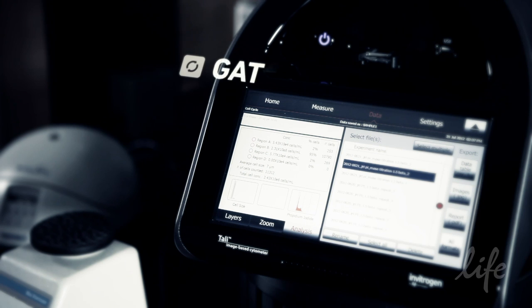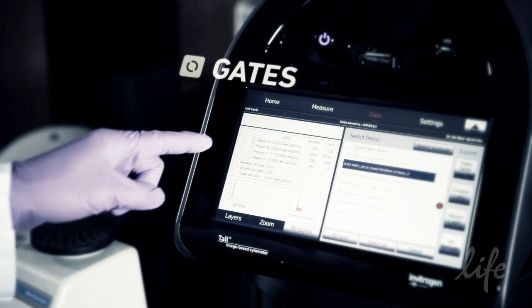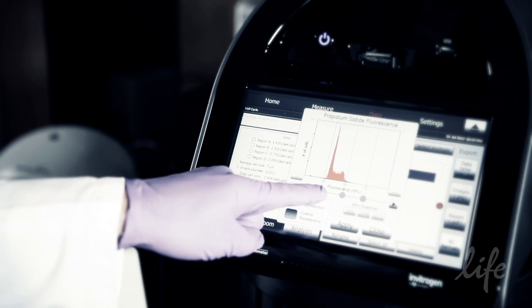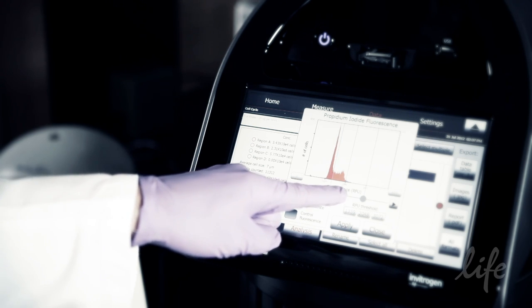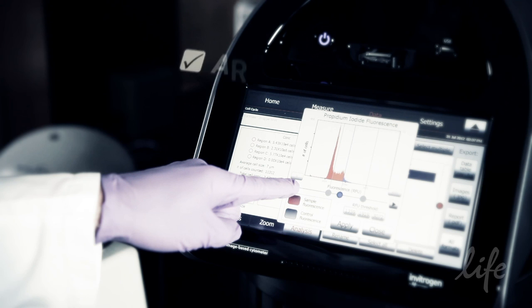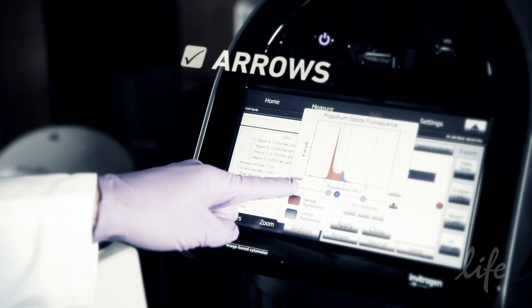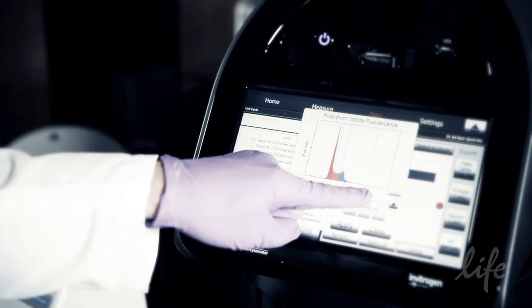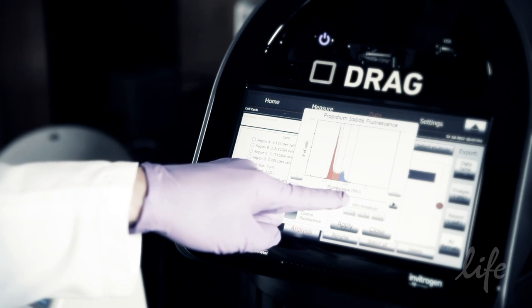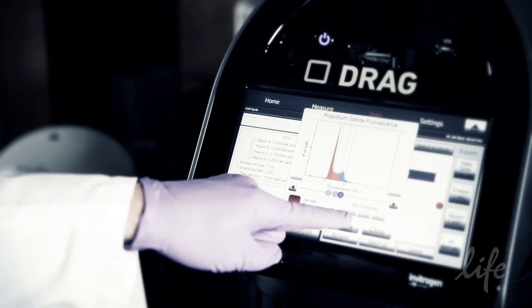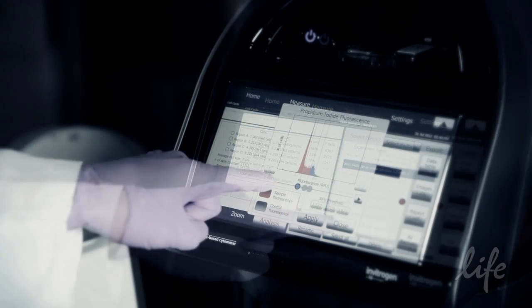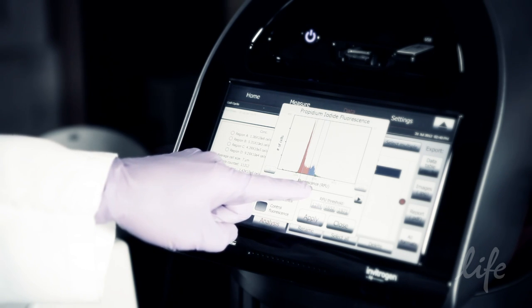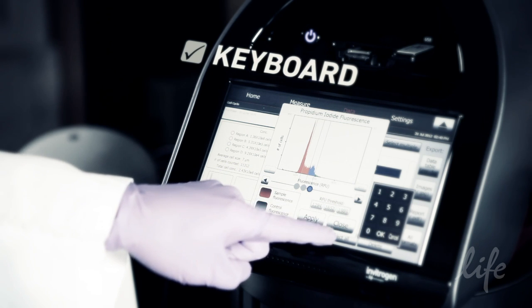The threshold gates for each cell cycle phase can be set in three ways. First, tap to select one of the three threshold bars (the grey vertical bars on the histogram); the selected bar will turn from grey to blue, then tap the arrows at the bottom of the histogram to move the threshold bar. Second, tap to select a threshold bar and drag it to the desired location. Third, tap on the numbers under RFU threshold; a pop-up keyboard will appear and values can be entered manually.